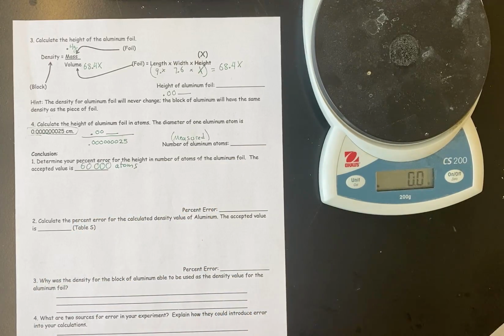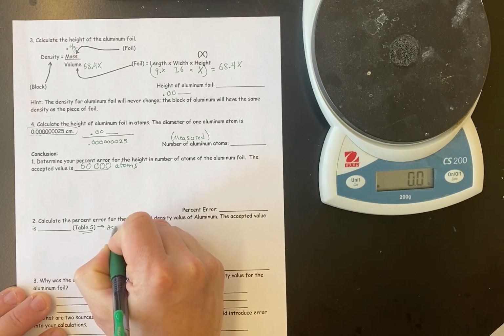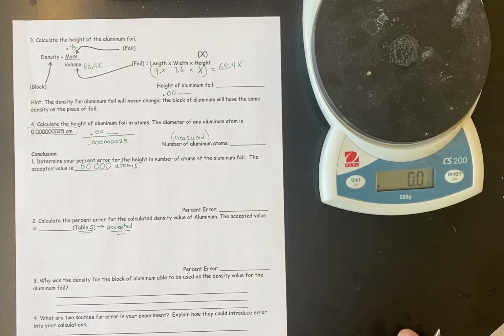The next thing you're going to do is you're going to see if there's any error in your density for your aluminum. In other words, if you go to table S and you look up the density of aluminum, that is going to give you your accepted value for the density. And then if you go back to step 1, when you calculated the density of aluminum, that's going to give you your measured value for the density of aluminum. Do a percent error. There's 2 more questions at the end.